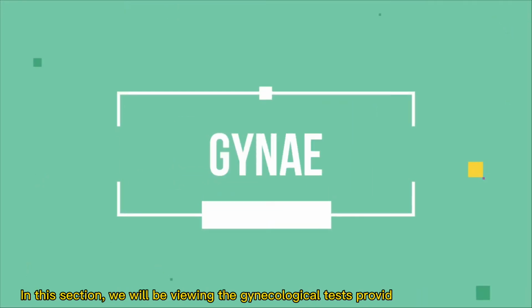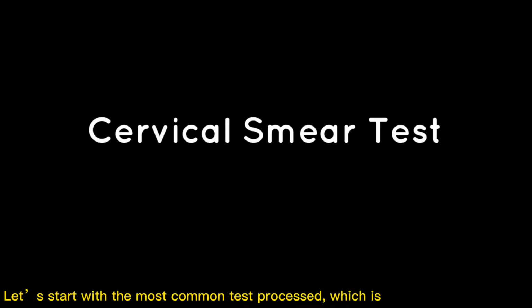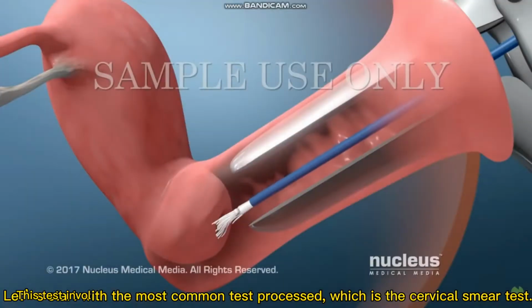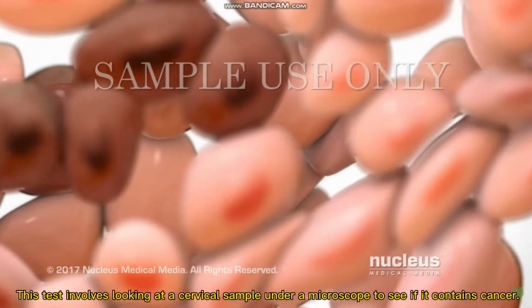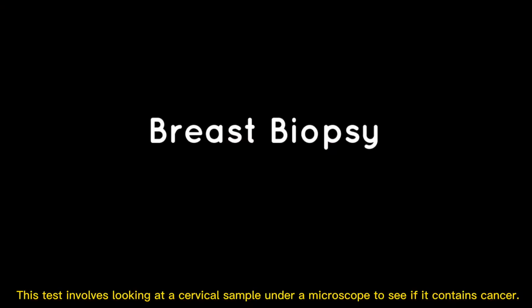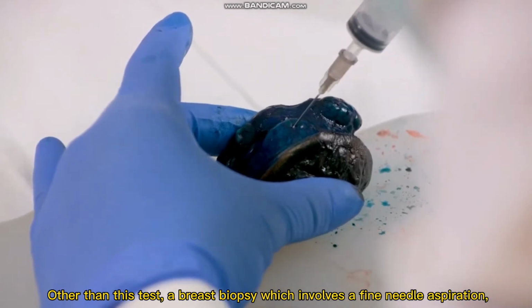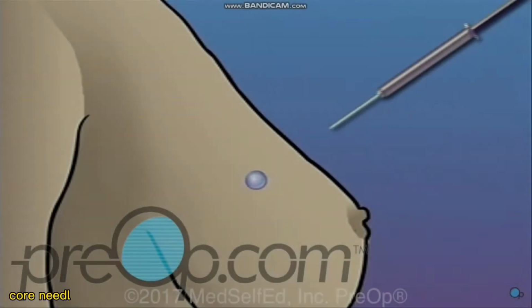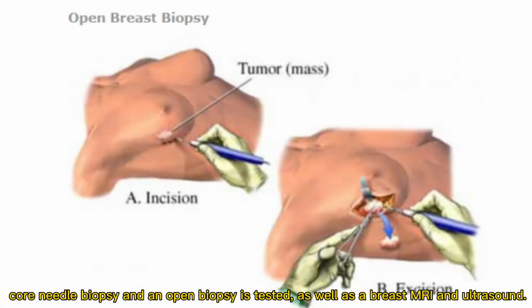In this section, we will be viewing the gynecological tests provided by this laboratory. Let's start with the most common test process, which is the cervical smear test. This test involves looking at a cervical sample under a microscope to see if it contains cancer. Other than this test, a breast biopsy, which involves a fine needle aspiration, core needle biopsy, and an open biopsy, is tested, as well as a breast MRI and ultrasound.